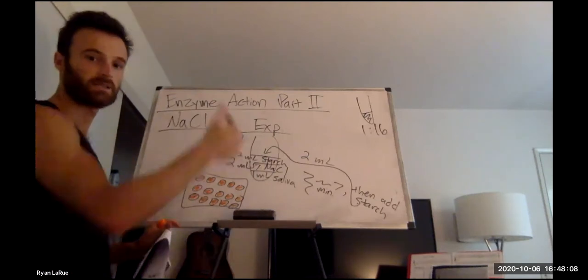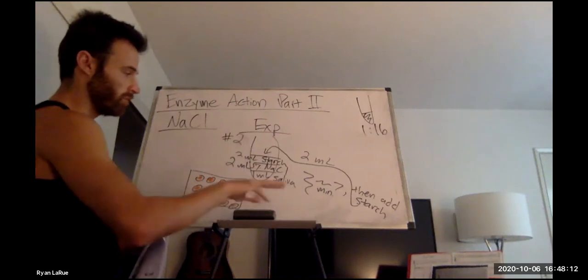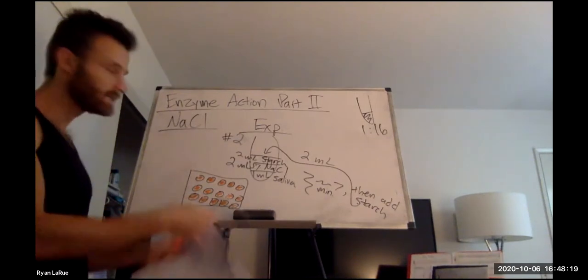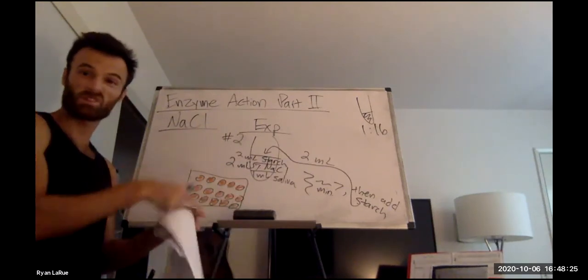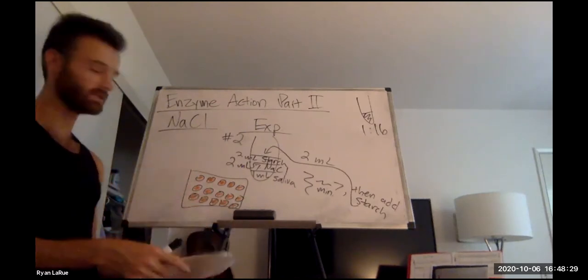Wait 30 seconds, pipette, 30 seconds, pipette. In the row below that, and so on and so forth for the higher percentages available. And you'll learn, as the enzyme's exposed to higher levels of NaCl, how that's affecting the reaction. Is more starch being broken down or less in these higher salt conditions?